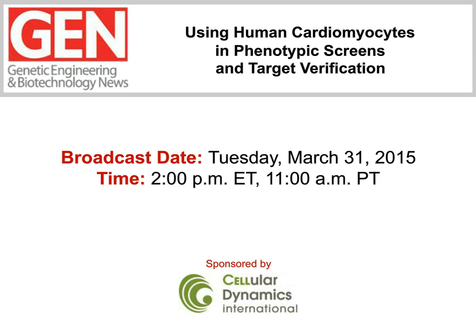The transition from conception to implementation has happened fairly quickly, moving from launch to regulatory evaluation and use in drug discovery screens in 3 years. Our webinar presentations will highlight examples and the utility of using human iPSC-derived cardiomyocytes in drug discovery and screening efforts.